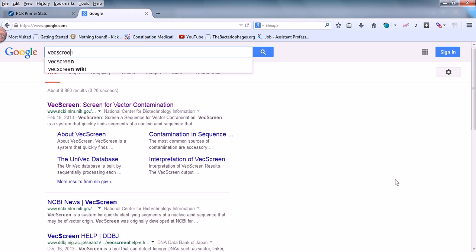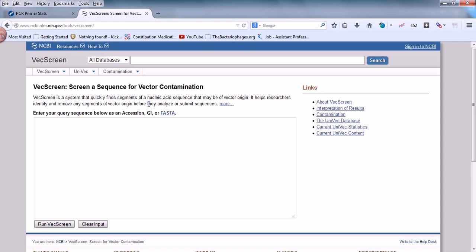Simply search for VecScreen in Google and it will take you to the NCBI tool for VecScreen. It's described as a system that quickly finds segments of nucleic acid sequence that may be of vector origin. It helps researchers identify and remove any segments of vector origin before they analyze or submit the sequence.